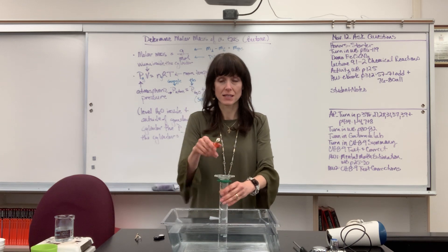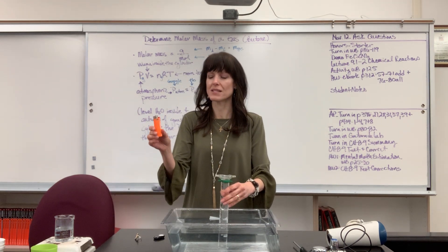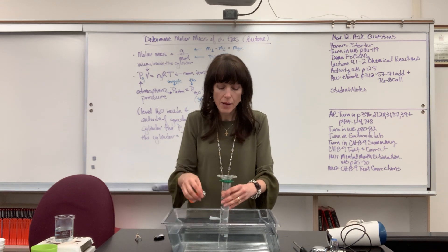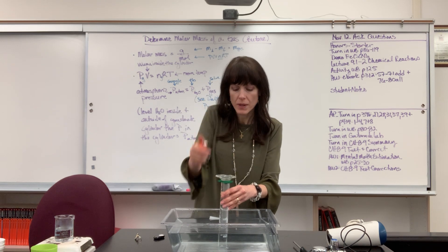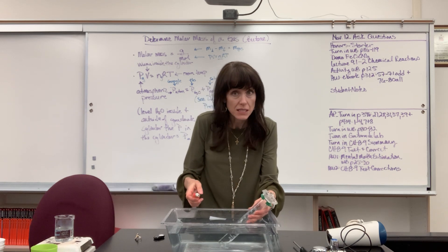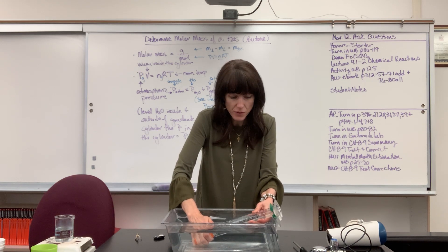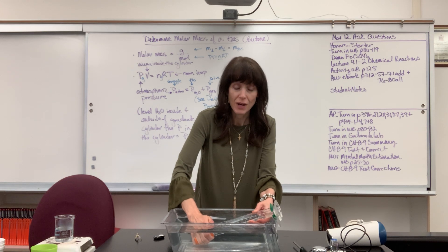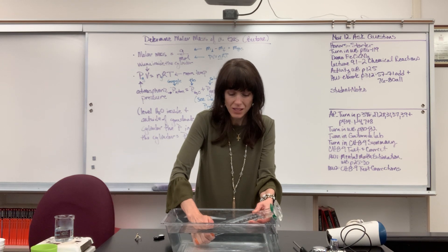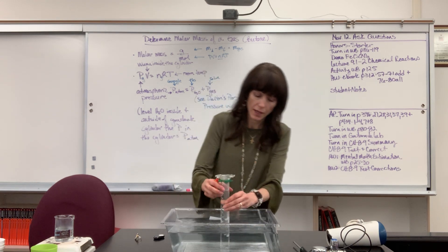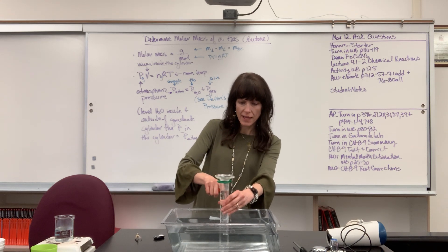Now I'm going to release the butane gas into this. I've already weighed this to see what the mass of the container and the gas is. I put this under the water and I put the opening of the butane lighter inside the graduated cylinder, then open it up so the gas gets caught inside. I tilt it underneath and I can see bubble, bubble, bubble — all the gas from the butane lighter going into my graduated cylinder. You just sit and hold this until you get about 80 mL of butane gas.